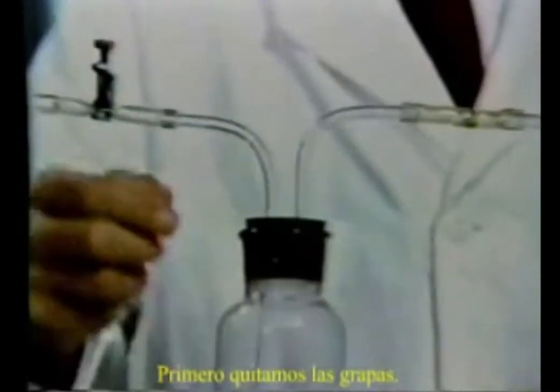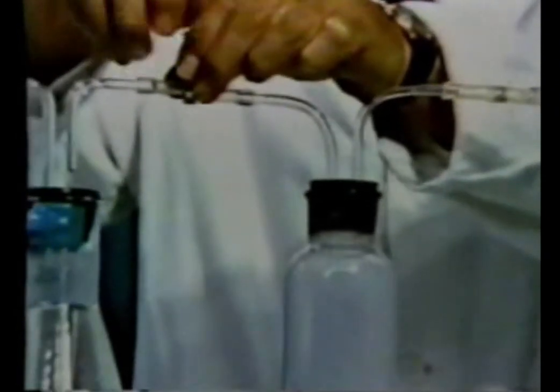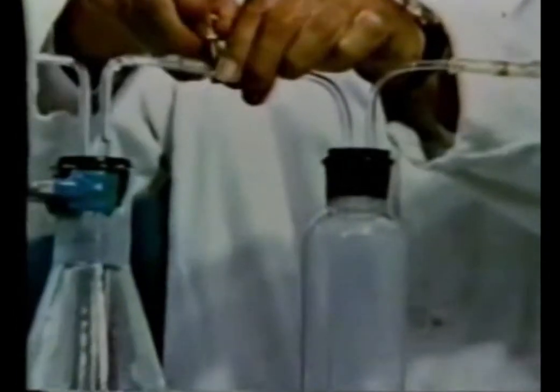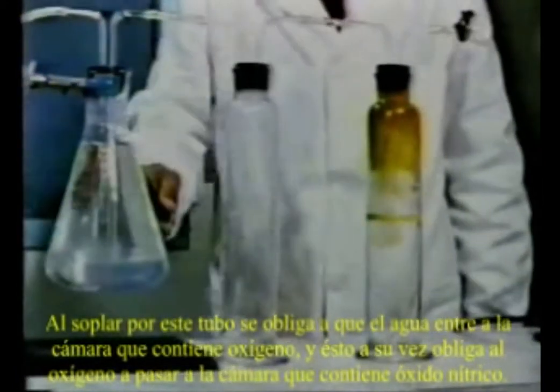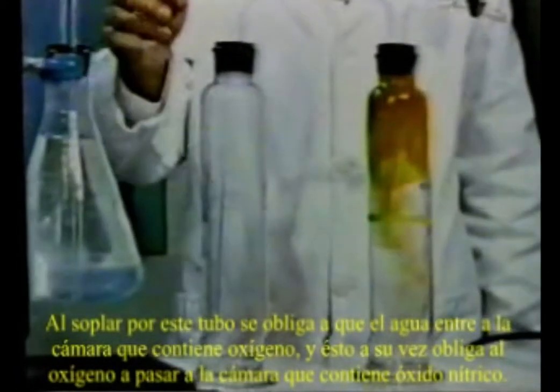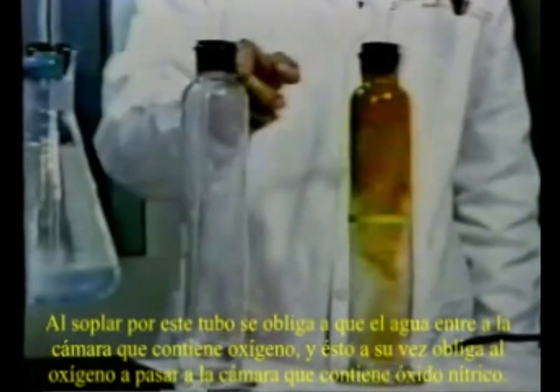First, we remove the screw clamps. Blowing into this tube causes water to enter the oxygen chamber. This forces oxygen over into the nitric oxide chamber. The color of nitrogen dioxide appears.